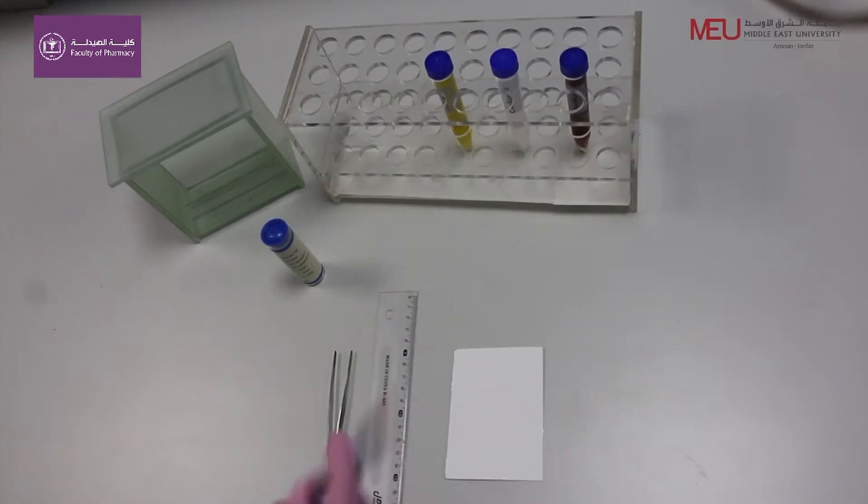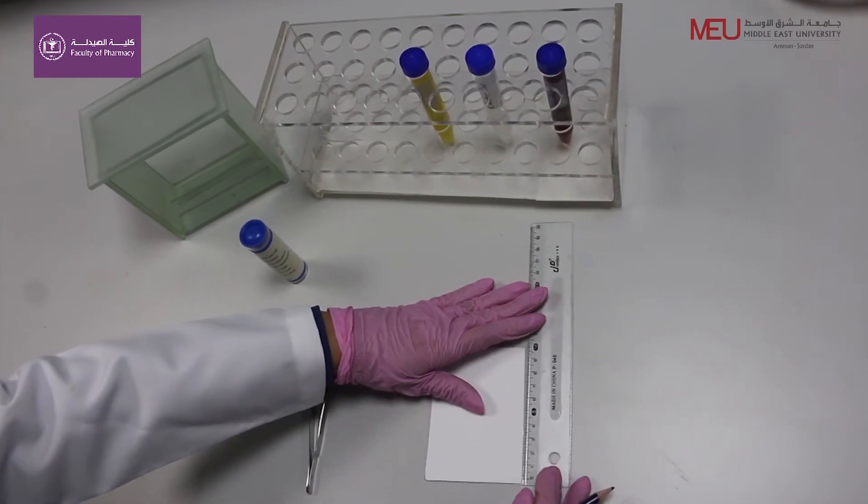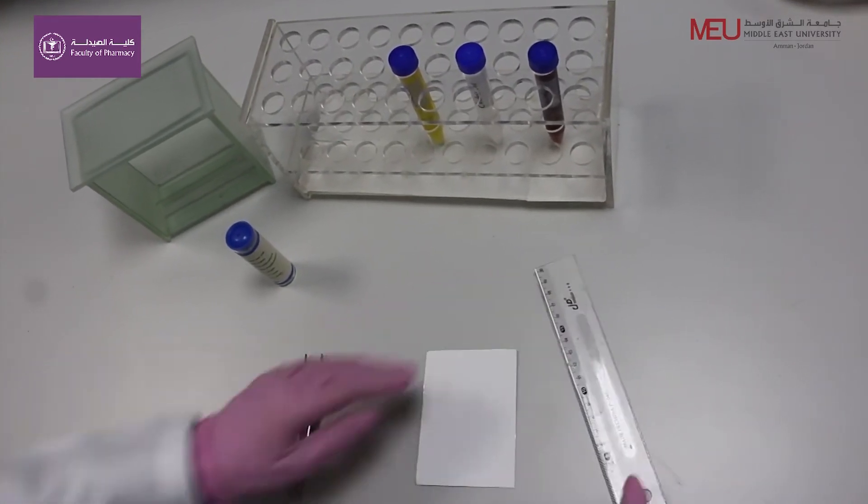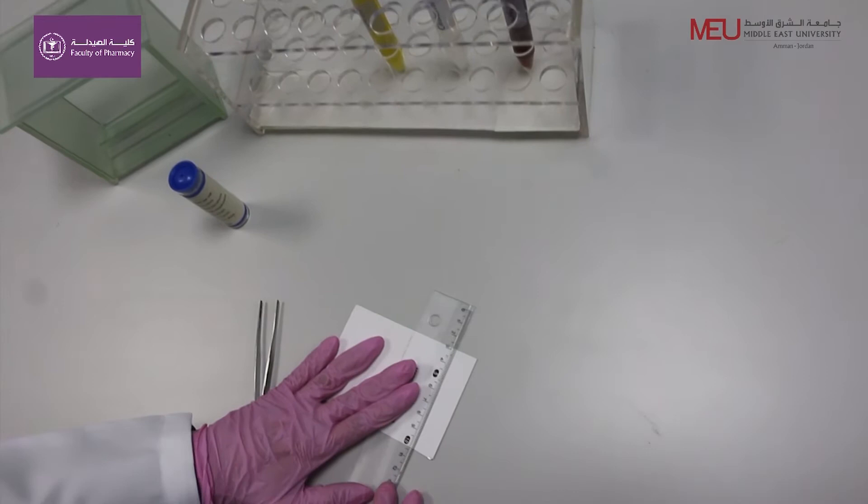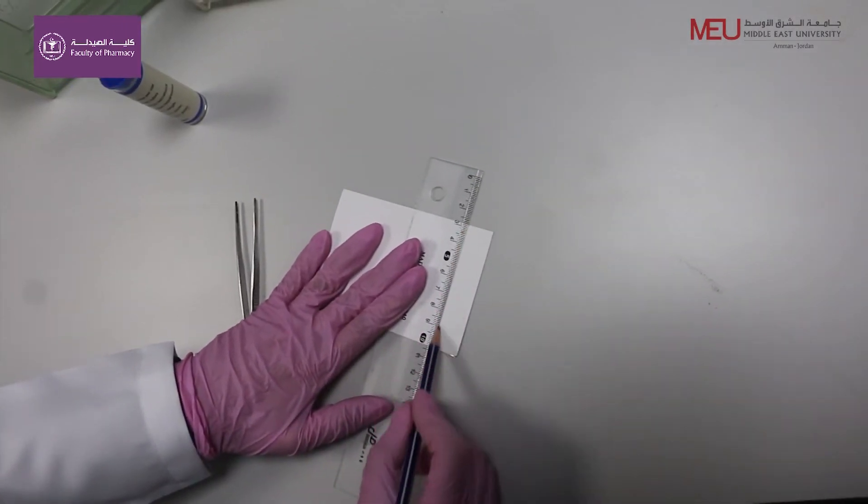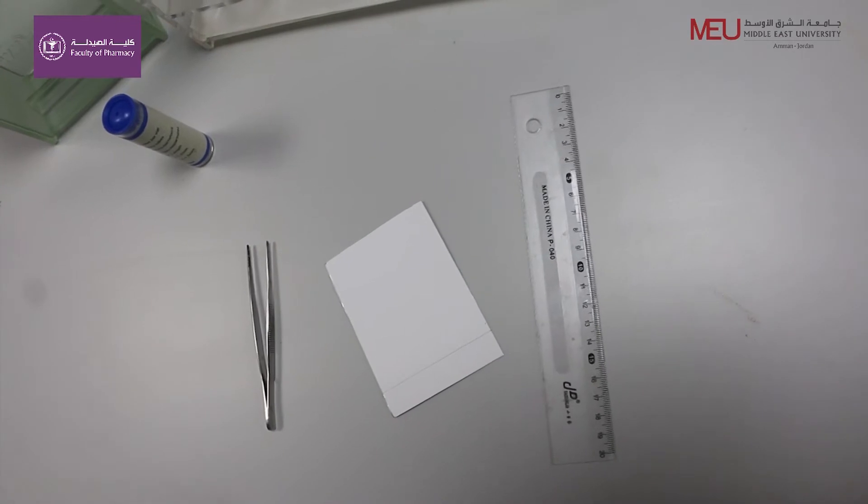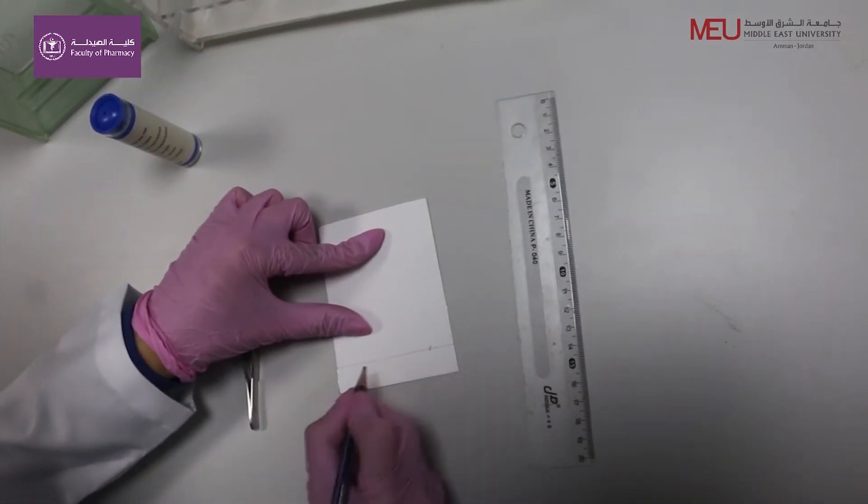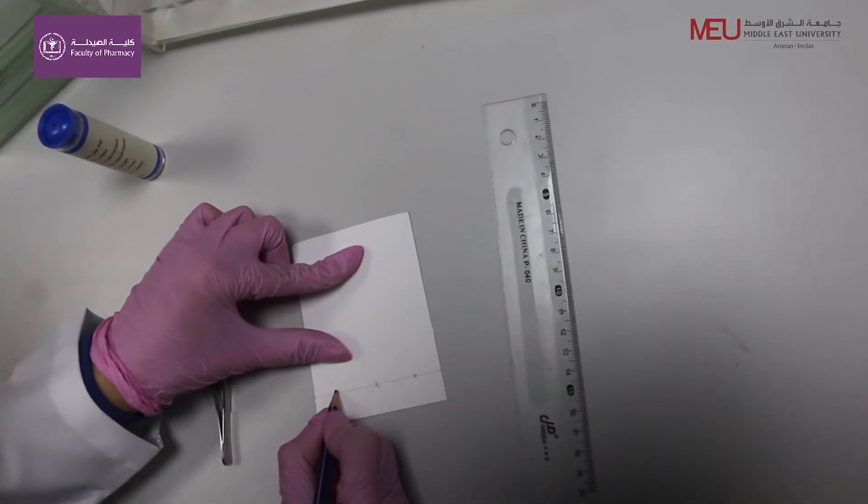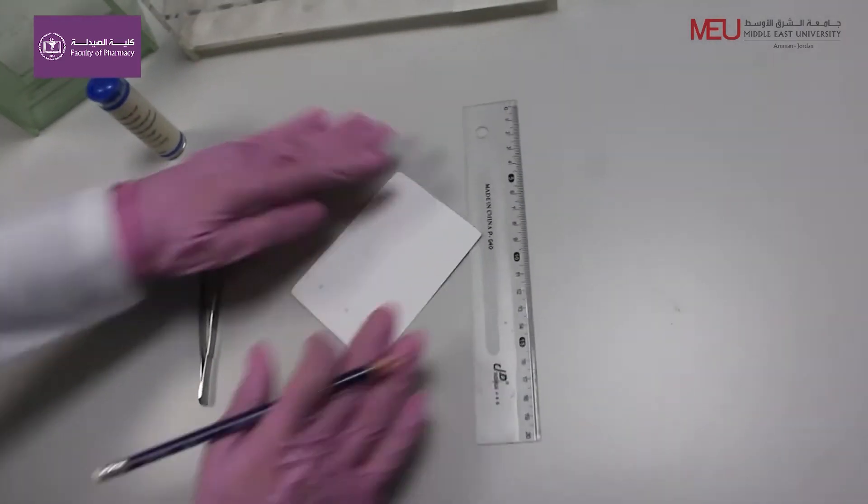Using a soft pencil, gently draw a baseline one and a half centimeters from the bottom of the plate. Do not scratch or damage the silica surface. Lightly mark three positions at least one centimeter away from the edge of the plate.